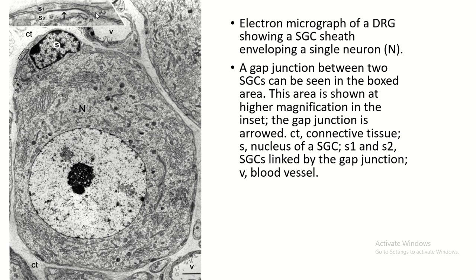This is the enlarged view of two satellite cells. This is the cell membrane of one satellite cell, this is the cell membrane of another satellite cell, and this is the gap junction in between the two satellite cells.